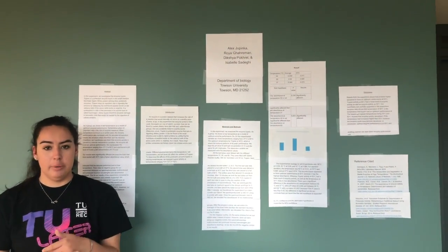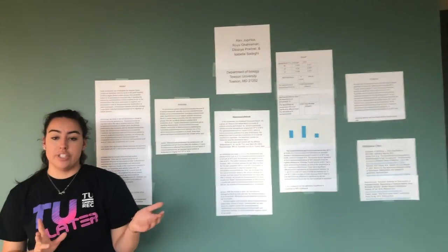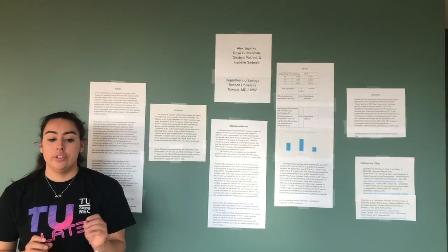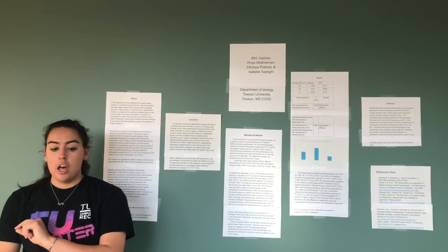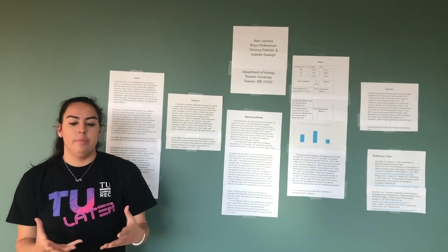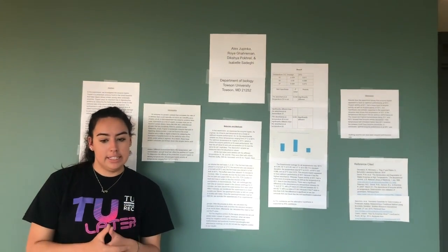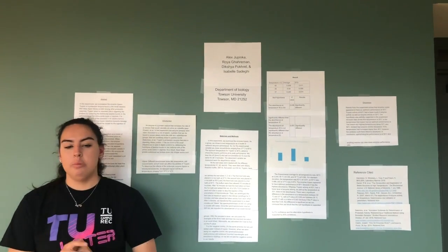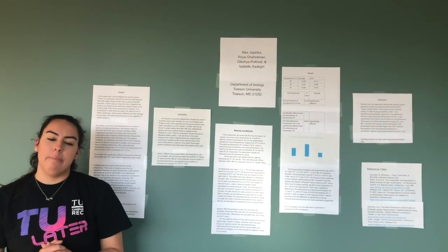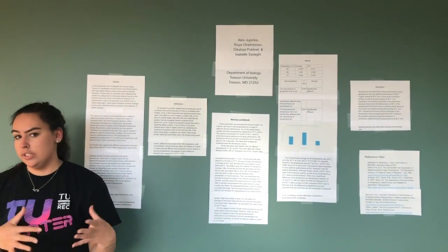Between our first and second experiment, we did have a few major changes and improvements. For example, we increased our pH level from 8 to 9 based off the observations of other groups. We also increased our experimental temperatures because our first time around we used lower temperatures and didn't have the best results for that. So these changes allowed us to have more ideal conditions for our enzymes. And in future experiments, it would be beneficial to make improvements related to preventing errors. So finding a better way to test our samples in water baths, or just in general, decreasing any error that we had.